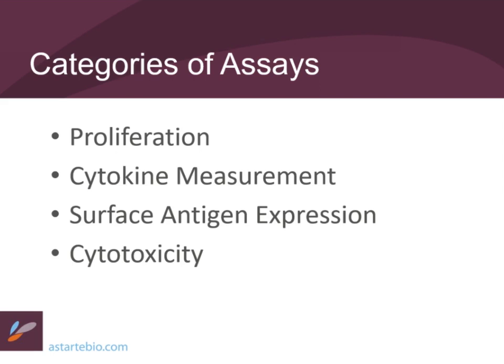And finally, cytotoxicity, which is often the endpoint that we want to get to when we're doing therapeutic interventions. We want to have those cells either cytotoxic or not cytotoxic. And so that's a nice readout to be able to deploy.